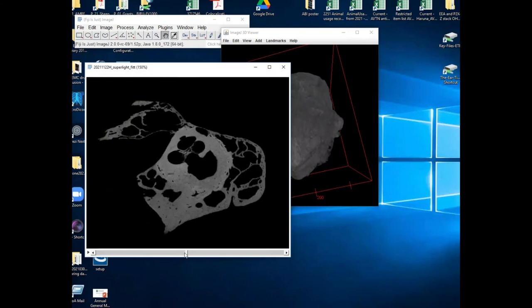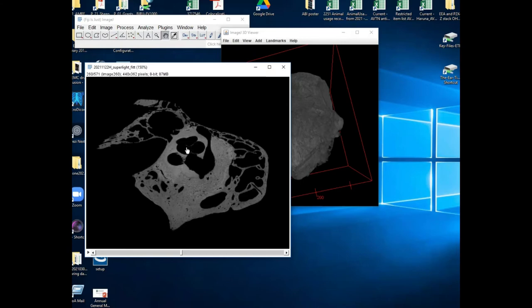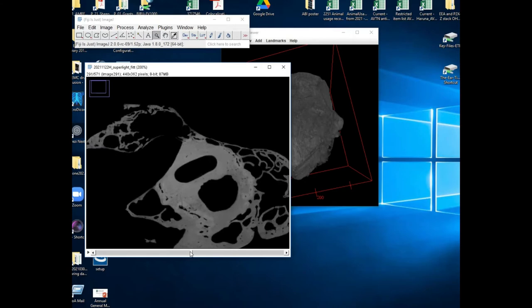Now in this cross section, number 260, so about in the middle, we see this basal turn. Basal turn, middle turn, apex of the cochlea. I'll just move up and down, up and down. Can you see that? See this back there?